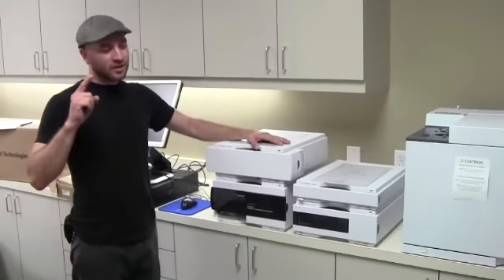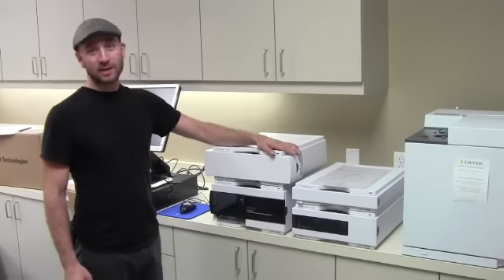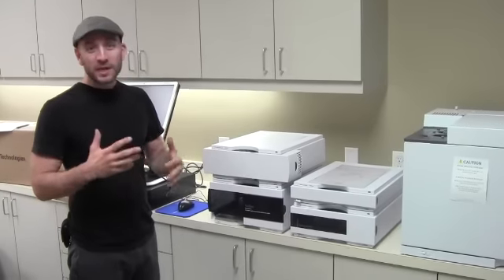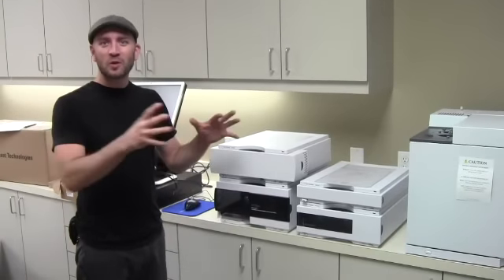HPLC — used to be called high pressure, now high performance liquid chromatography. Really good for measuring things that have to stay in a liquid form. Really great for measuring fermentation performance, for looking at the efficiency of our enzymes when we're doing starch conversions when we cook our grain. We'll use it for QA/QC on our processing side, so before distillation.